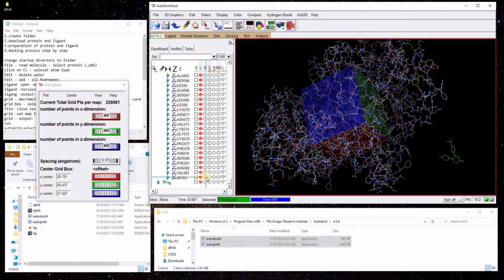So to see this, we can also bold this, and we can change it a little bit to see.